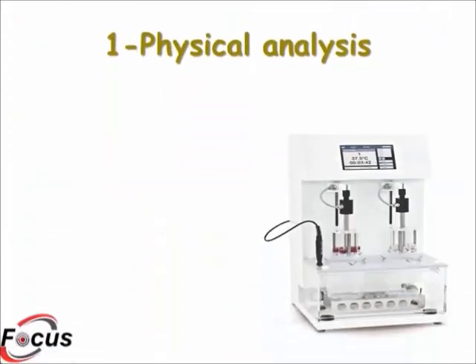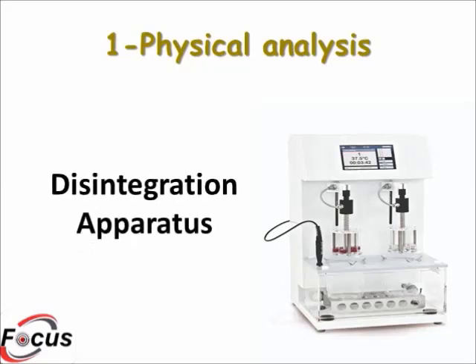And as a second example for physical testing is the disintegration apparatus. And this is to ensure the tablet or capsule will dissolve and disintegrate during the specified acceptable time.